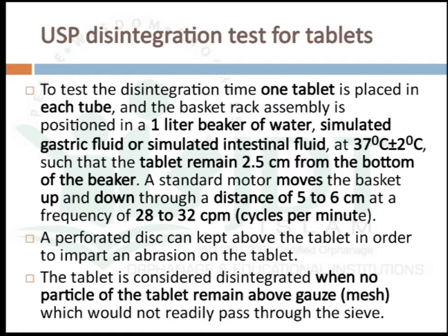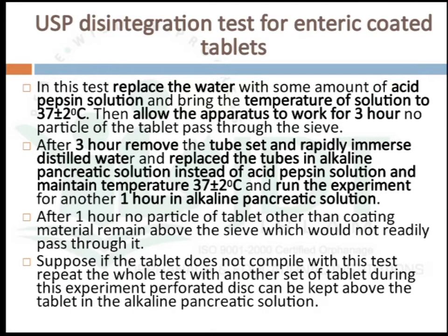The tablet is considered disintegrated when no particles of the tablet remain above the gauze mesh, which would not readily pass through the sieve. USP disintegration test for enteric coated tablets: in this, water is replaced with acid pepsin solution at 37 plus or minus 2 degrees Celsius, and we allow the apparatus to work for 3 hours. For these 3 hours there should not be any particle release.